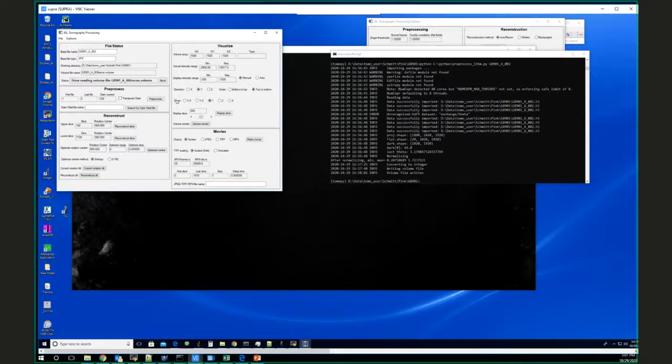It's just a little. Yeah. I mean, right now I've got the slits in the hutch set just a little bigger than that. We said it was an 11.0-something millimeter field of view. We calculated the slits are just a little bit bigger than that. So the beam is just a little bigger than the field of view.